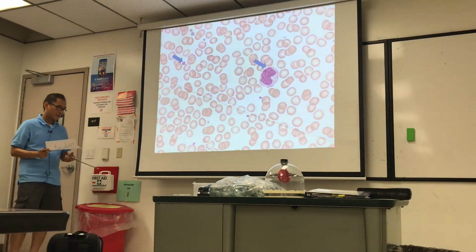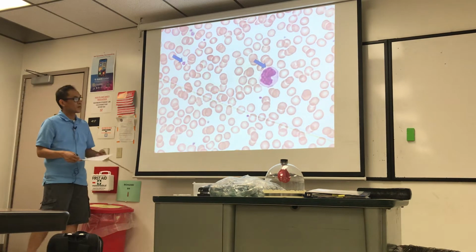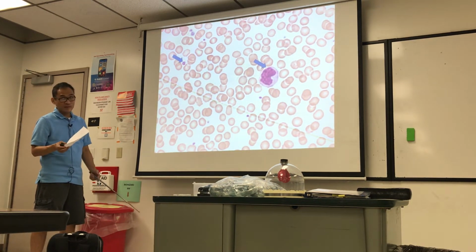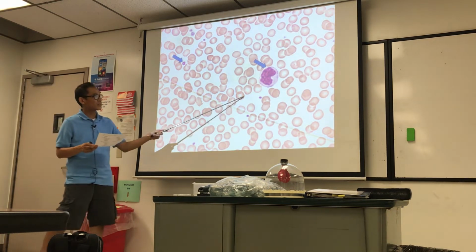Flip to the back here. So for the blood smear slide, I just kind of went around and tried to take pictures of something. I point to some things, okay, like for example, this is a monocyte.